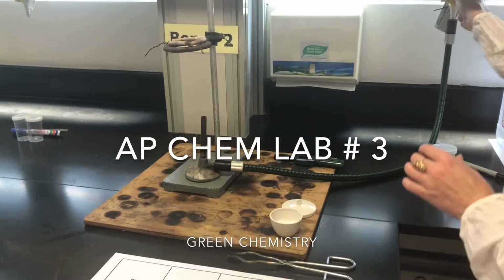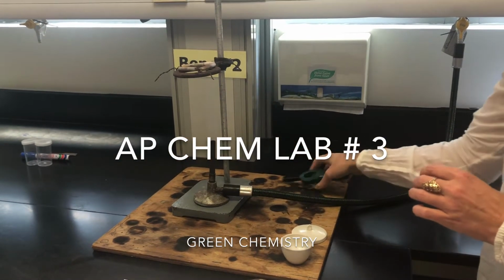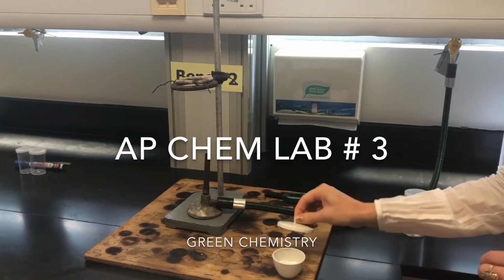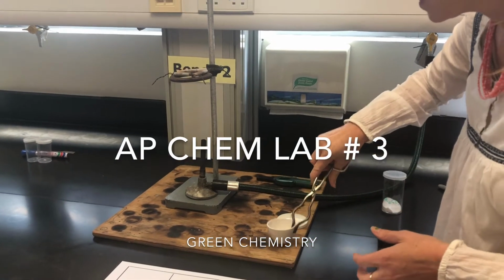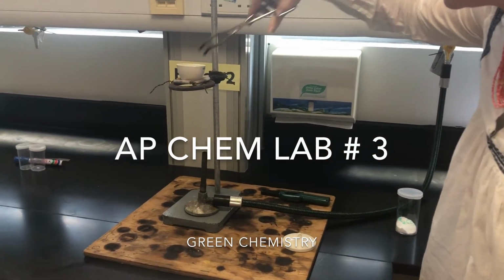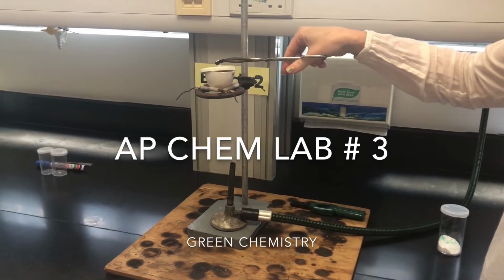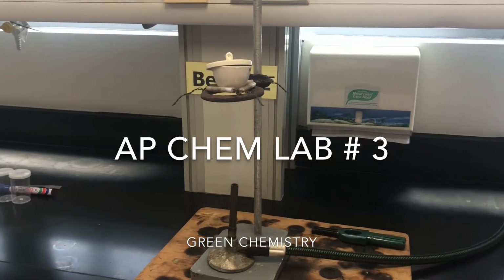Once I've done that, I'm going to turn on my gas and place my crucible on top with the lid just a little bit ajar, and I would heat that up and wait for some period of time.